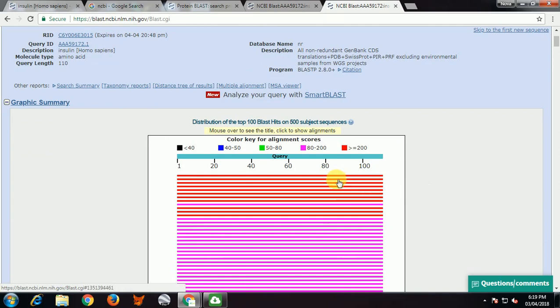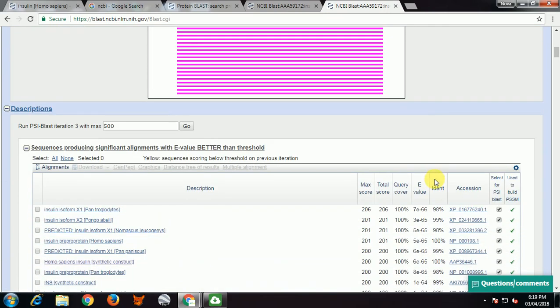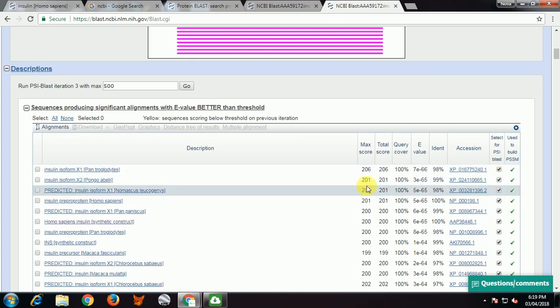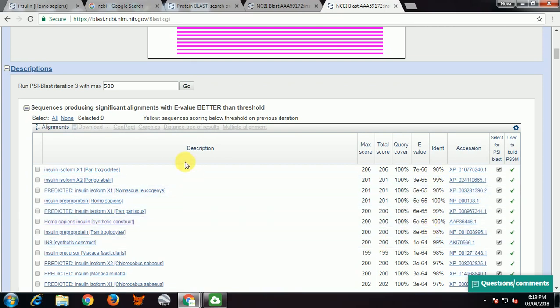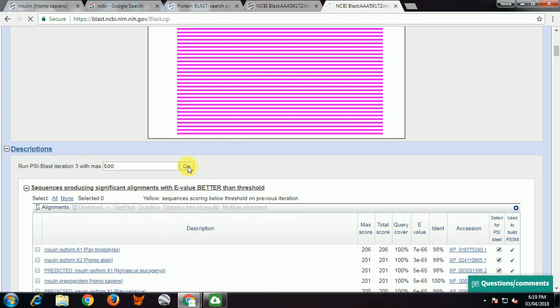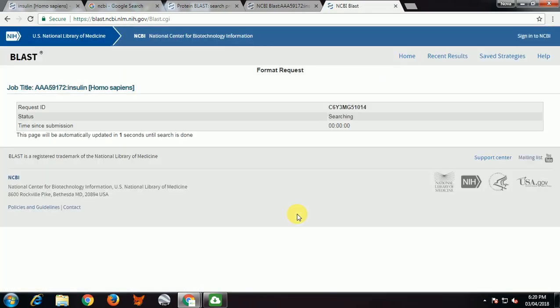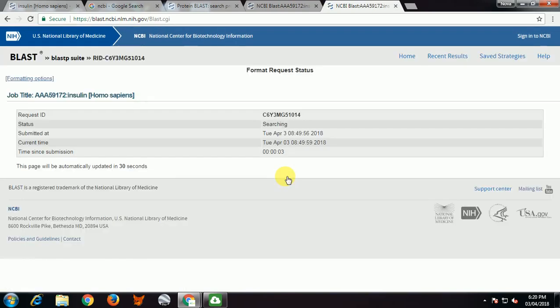We can see the result has come from PSI-BLAST iteration 2. You can see the red lines have decreased, meaning alignment score has dropped — identity and similarity are less in this result. The first sequence is different from the previous first-iteration result, and identity is also different. You can click on PSI-3 to perform a third iteration. More and more iterations you perform, the more divergent sequences you get.